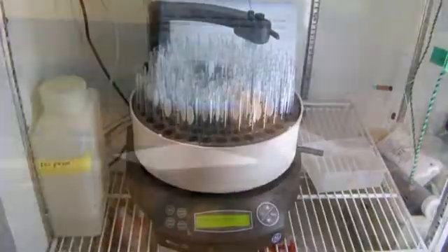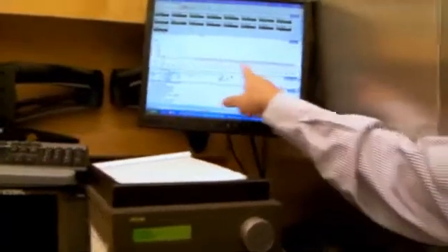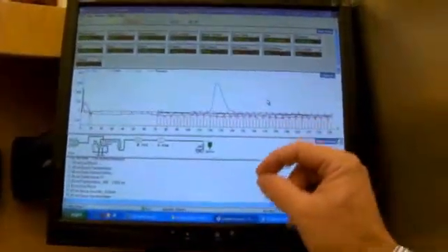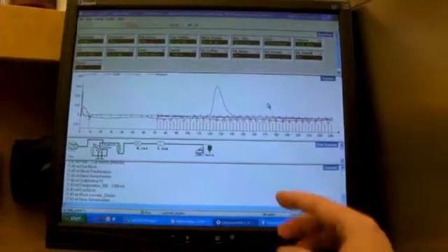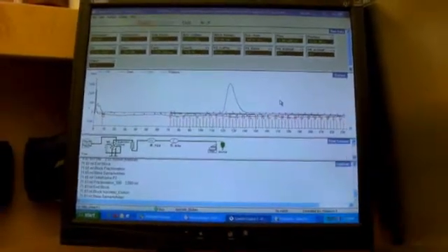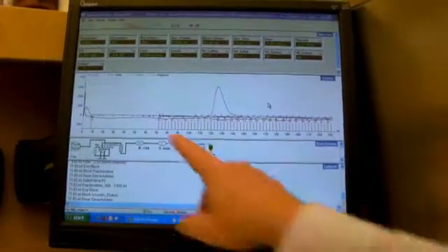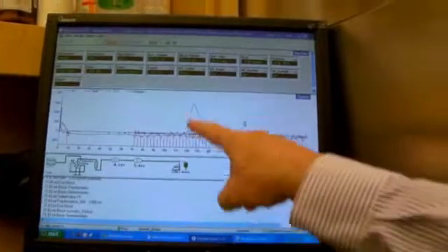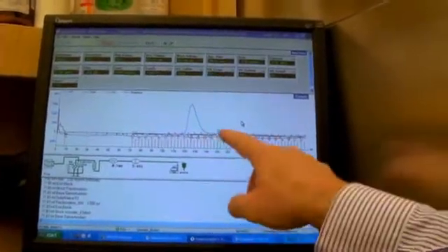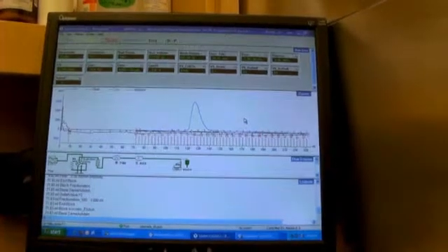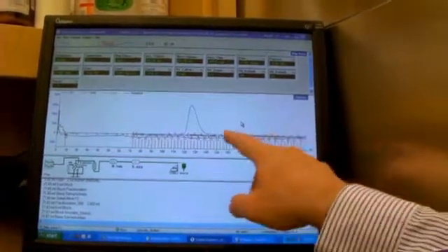Here we can see a trace of what's been happening. So the blue line is the UV absorbance. When the proteins come off, you'll get an increase in absorbance as they go past the detector. There's basically nothing happening, and this is the protein we're after. It gave us a nice peak, and you don't see a whole lot else because this is already fairly pure. This is actually looking really good. I'm happy with this.